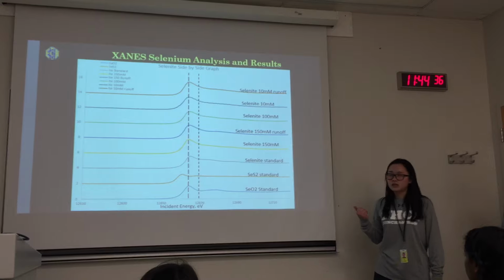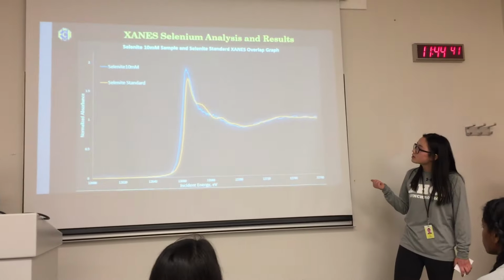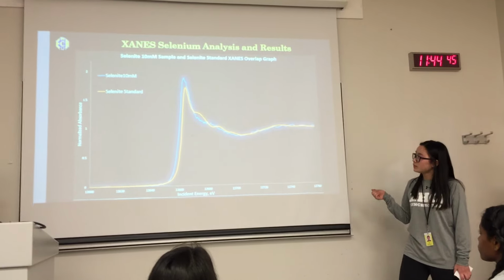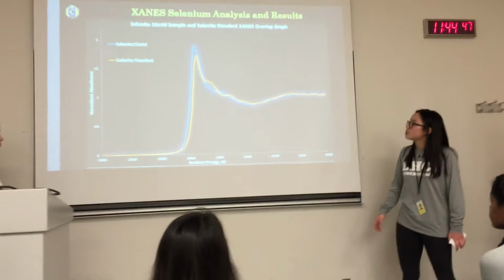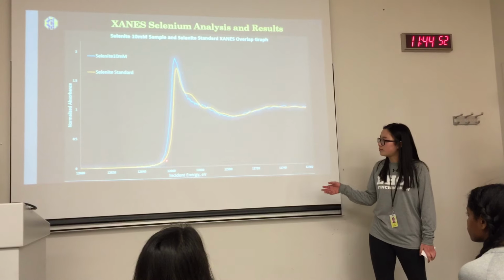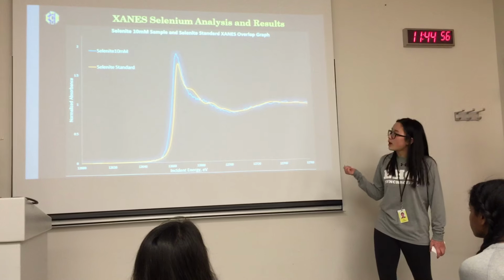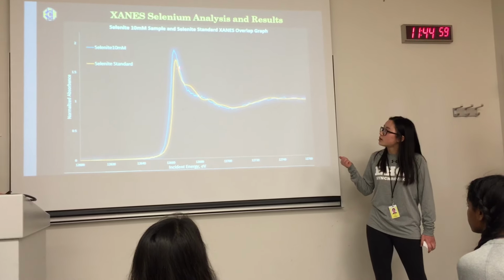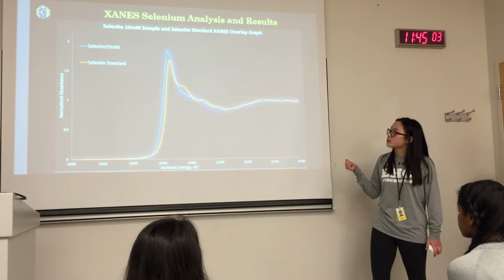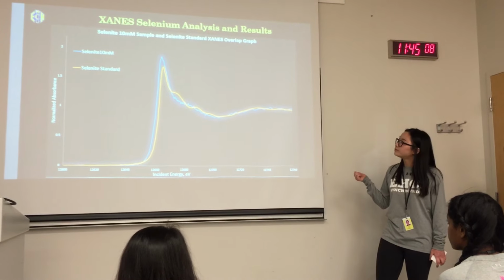So here we're gonna take a closer look at the selenite sample in our selenite standard, sodium selenite. You can see the difference apparently. The positions according to the x-axis are different, so we see there was an energy shift, and the peak here is higher than the one in the standard, according to the y-axis normalized absorbance.